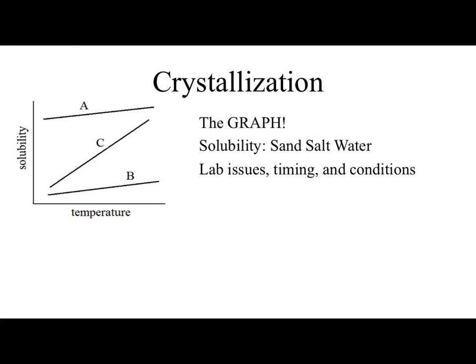Crystallization almost always throws people for a loop because everybody thinks I'm asking what's the ideal curve. The biggest part of the crystallization lab is looking at that solubility curve and identifying important things off of it. When we recrystallize something, what we're really relying on is variable solubility, where our compound is highly soluble at one point, and at another point it's lowly soluble. How about just not soluble?